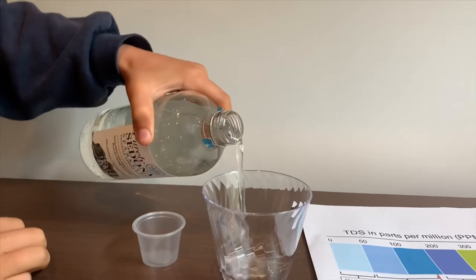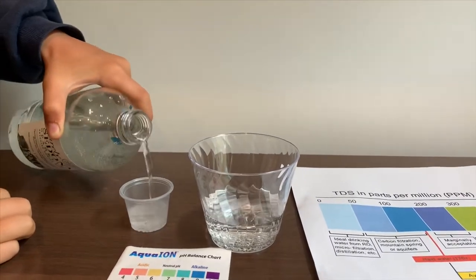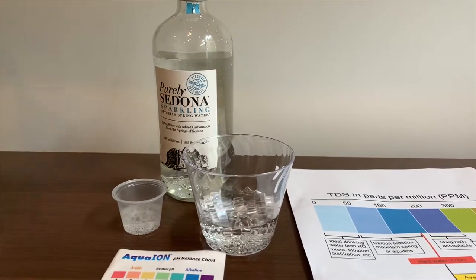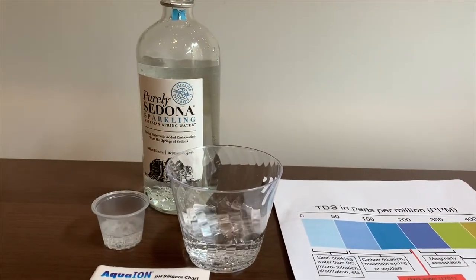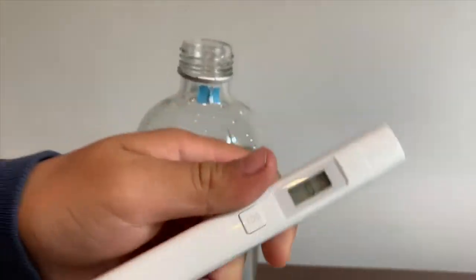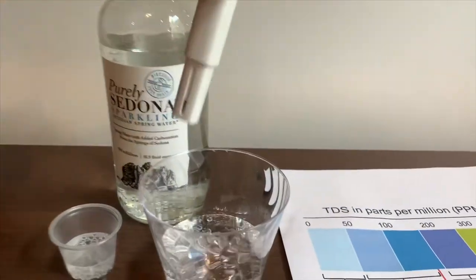Let's pour some water in. First we're going to test the TDS level, but let's stir it a little so we'll get a better result. It costs $2.19. Turn on the TDS tester, make sure it says zero, and put it in.